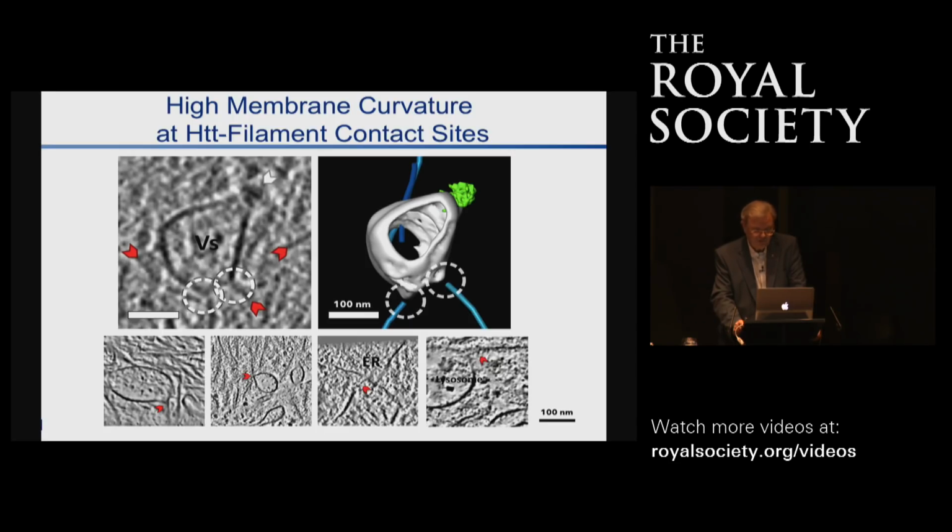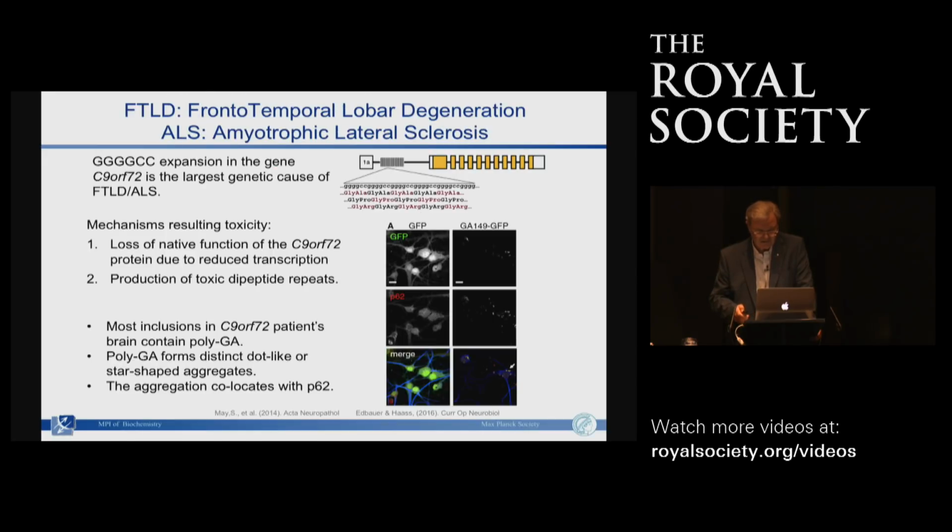The fibrils seem to poke the membrane, and you see it easier here in this magnified view: whenever they make contact with the membrane of the endoplasmic reticulum, they dramatically change the curvature of the membrane, and that obviously leads to some sort of disruption. There are extreme cases, which might be a little bit difficult to see. Here's a lysosome and here's a fibril, and it pulls out a large part of the membrane. We are trying to recapitulate these things currently in vitro to come to a more detailed understanding.